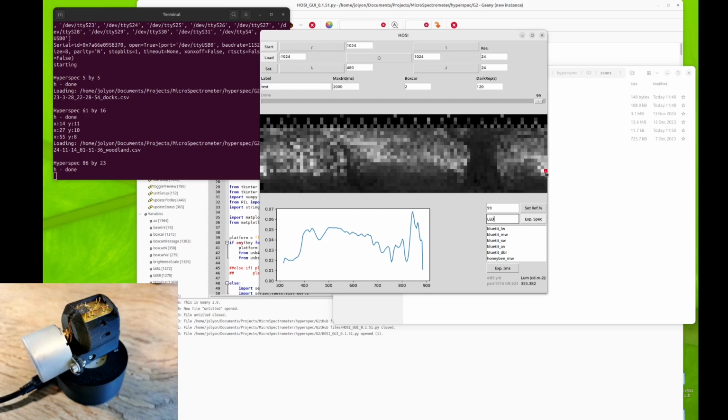So if I were to click on this pixel, the system has detected that some of these pixels have gone above the saturation threshold, which can in many other systems be very difficult to detect, but in this system it highlights it for you nice and easily. All the other pixels look good, but that should flag that you should be wary of measuring anything that is saturated in the scene. The unsaturated pixels in the scene will be completely unaffected and will be absolutely fine. So if we click on a pixel nearby, you can see that maybe we are getting around here some leveling off.